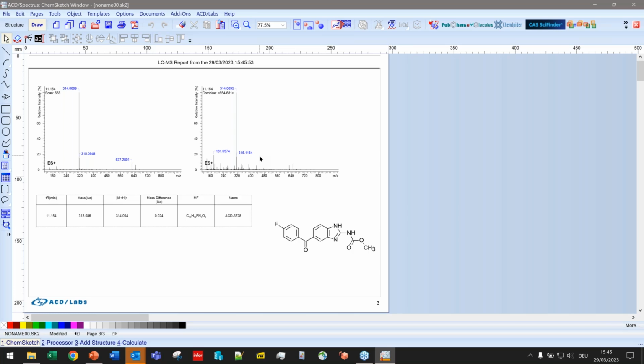So you can see with this result, I'm fairly happy, right? Now it shows my retention time so that I can actually read it. It's not in the way of any spectrum labels. We have the scan number, and on the right side, we have the combined number and the retention time again. I could have pushed it to the right side of the spectrum. That would have been an alternative to ensure visibility of these labels here.